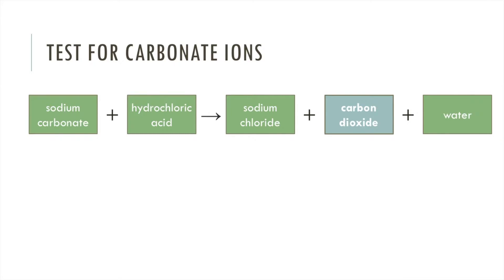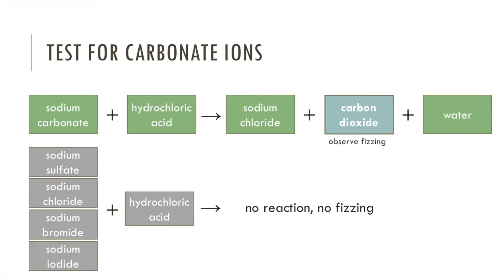I'm going to start off with a test for carbonate ions. If we add hydrochloric acid to sodium carbonate we get a reaction which crucially produces carbon dioxide. Carbon dioxide is a gas so we can identify its presence by fizzing. The other four solutions do not react with hydrochloric acid in these conditions, so there's no reaction and no carbon dioxide forming and so no fizzing.